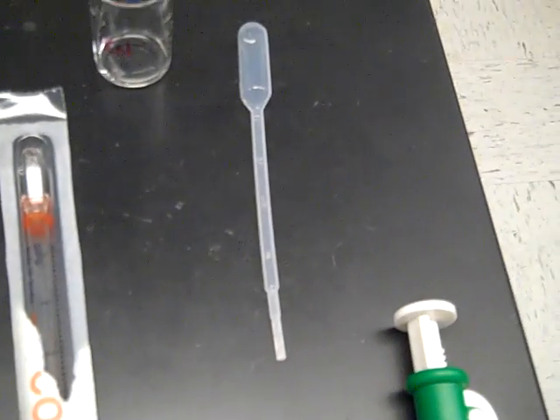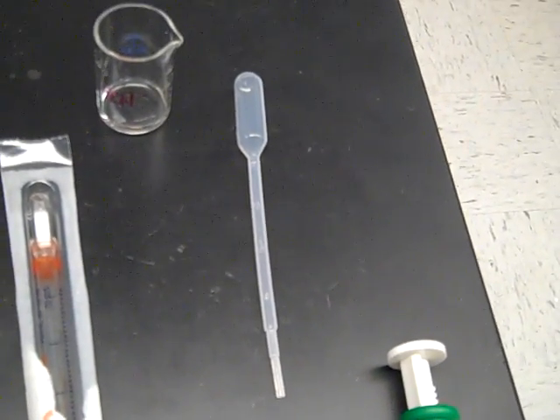And you'll use these barrel pipettes in transferring the solution from the test tube to the cuvettes.